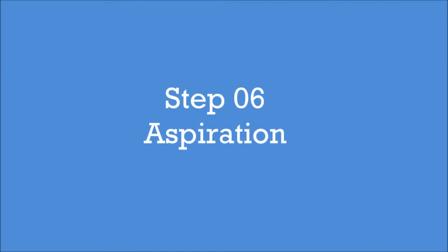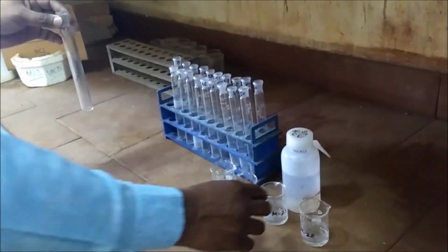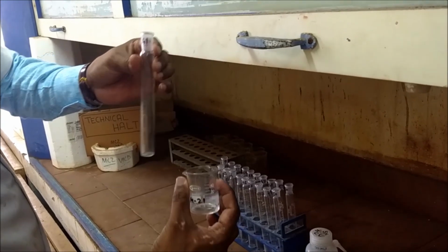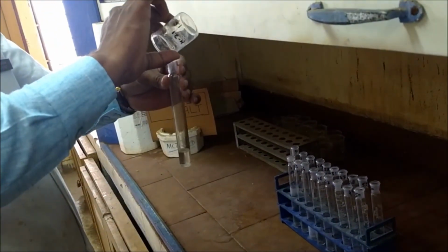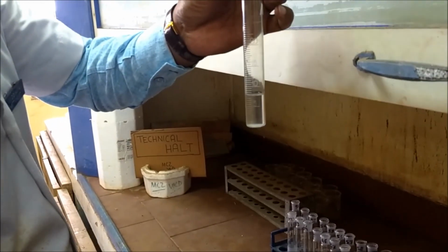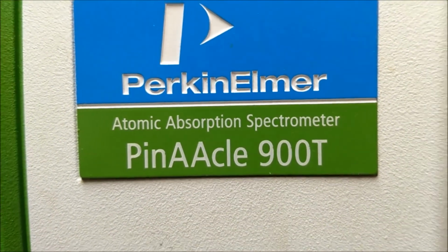Step 6. Aspiration. In this step, you will get the results of your hard work. These beakers are the cooled beakers from the previous step. Now we will transfer the content from the beaker to the test tube. While transferring, if required, we wash the beaker with 5% HCl solution, and we will make up the volume in the test tube to the 10 ml mark. After that, we close the lid and shake it vigorously and place it in the test tube stand for aspiration.